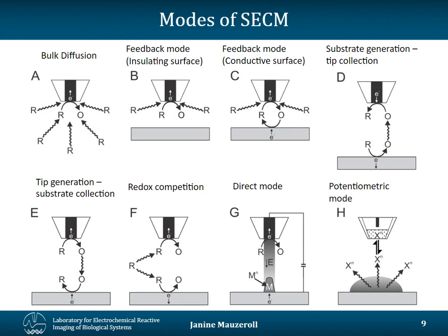And we can see that you can also collect a species that's formed at a surface in D. You can compete with the consumption of a species in solution, which is called redox competition mode, in F. And you also have modes that don't necessarily monitor the current. As I said, you have modes that involve the use of ion selective electrodes, which is presented in panel H as the potentiometric mode. So the point of this slide is to show you that in fact, SECM is quite versatile and you can apply it to a wide variety of situations where your substrate is reacting or generating a species of interest.